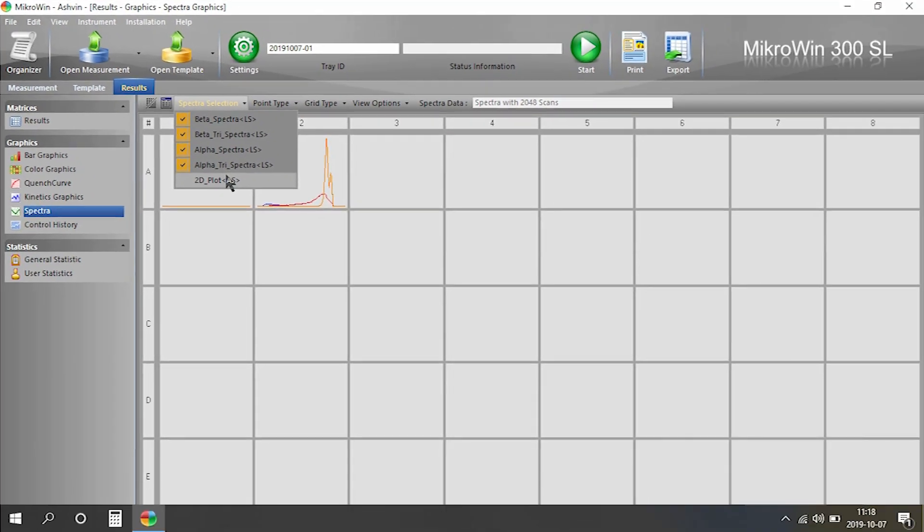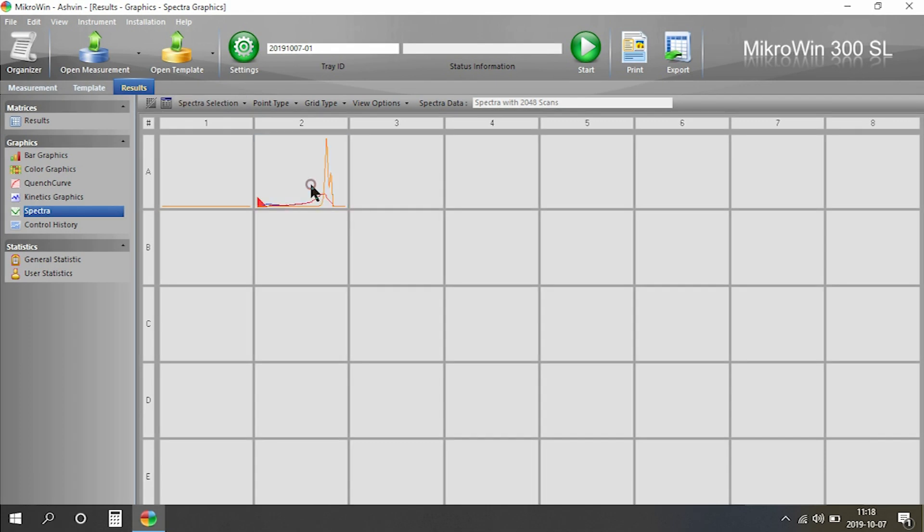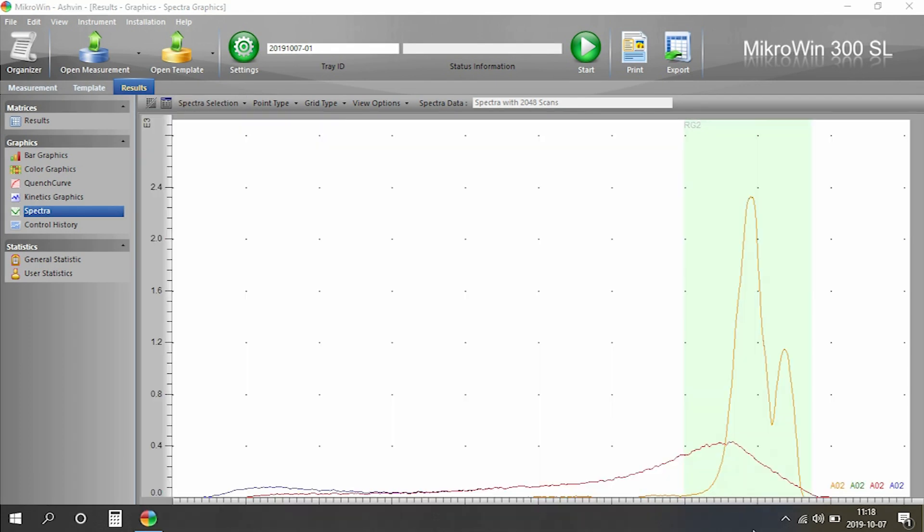You can view all of your spectra individually or together. If I select the sample and click the zoom button, I can see it in more detail.